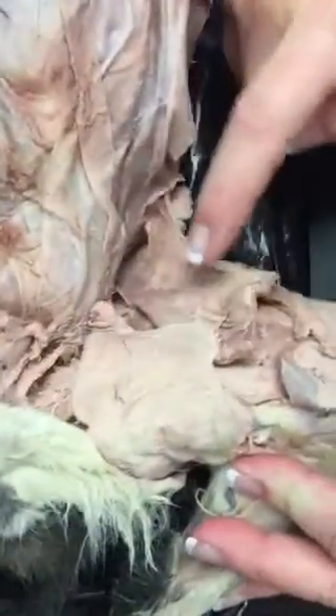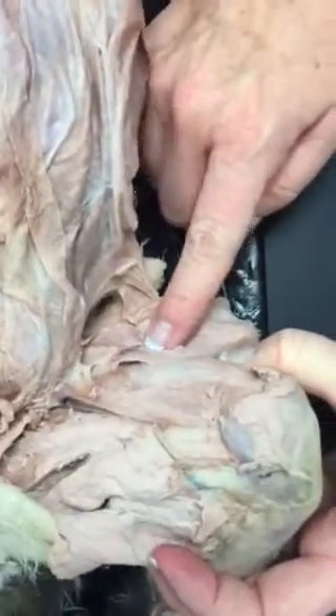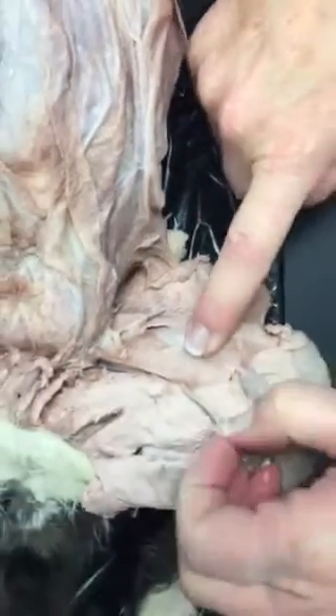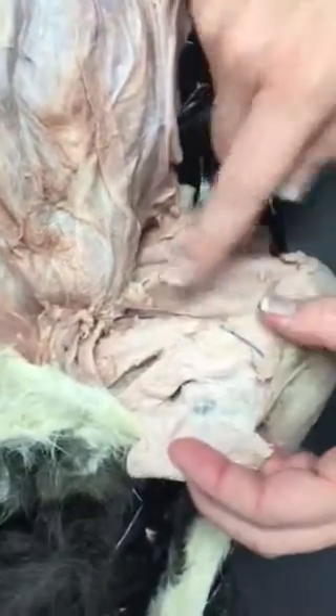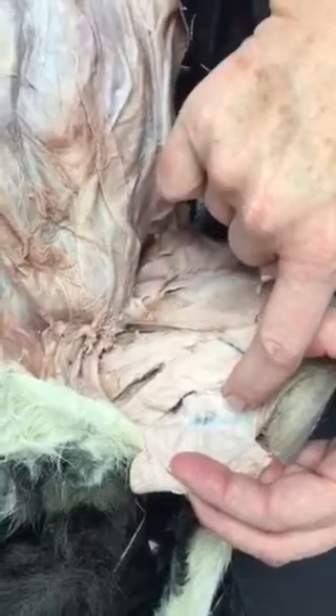Today, what you guys did — we have sartorius and gracilis. Underneath sartorius and gracilis, we have the muscles vastus lateralis, rectus femoris, and vastus medialis, and that is all under sartorius. Under gracilis, we have adductor femoris, semimembranosus, and semitendinosus.